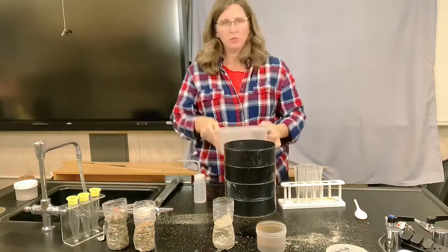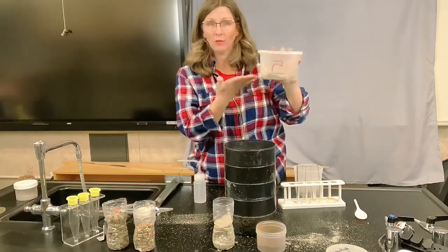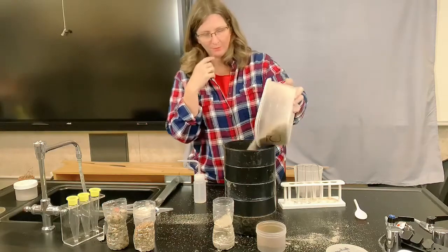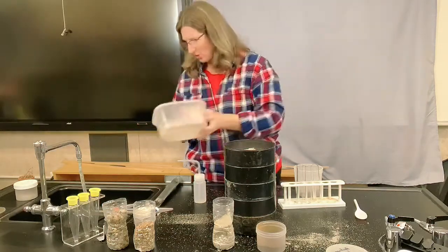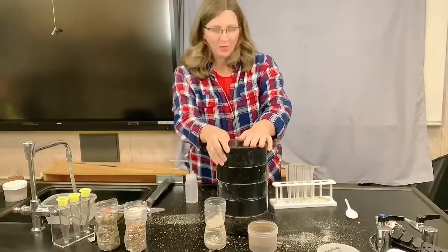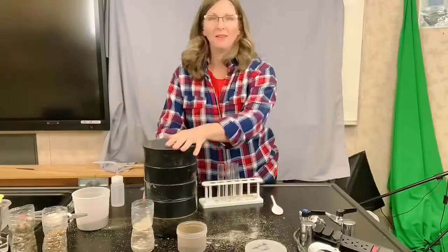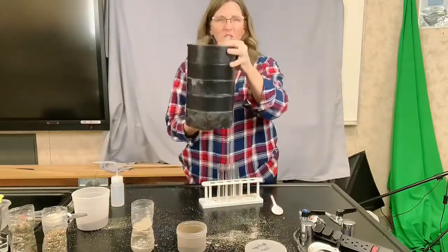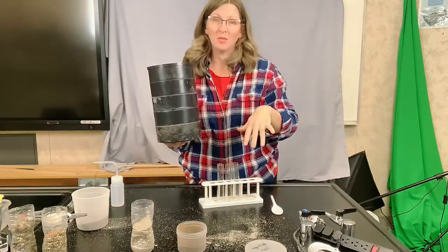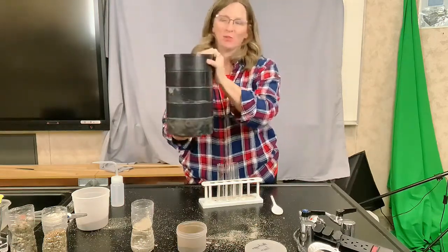So what you do is you'll take your mixed sediment, where we've got sand, gravel, silt and clay all together, and you'll pour it through. And then you just shake it and it goes through. This is just like those toys when you're a little baby and you had the little rain stick toy. All right, and you would just shake it and you would turn your toy and the beads would go through, and different size beads would stop at different layers. Exactly the same thing, it's just it's not a toy.